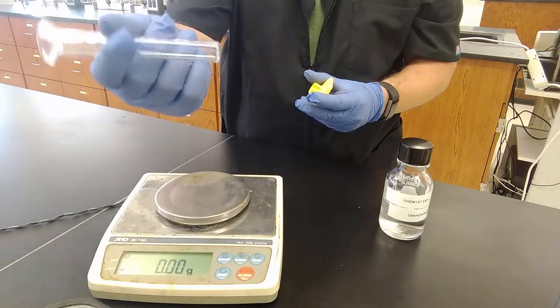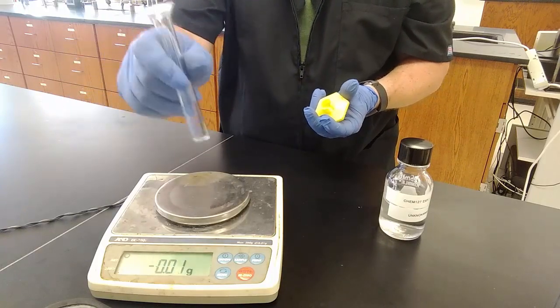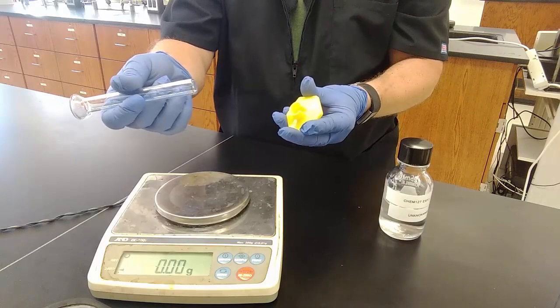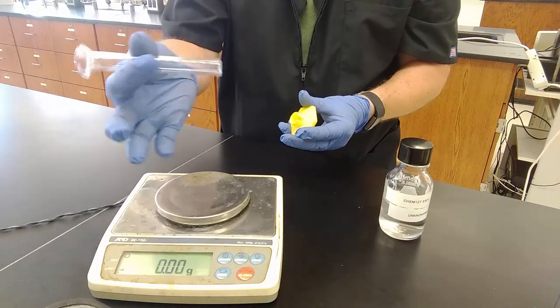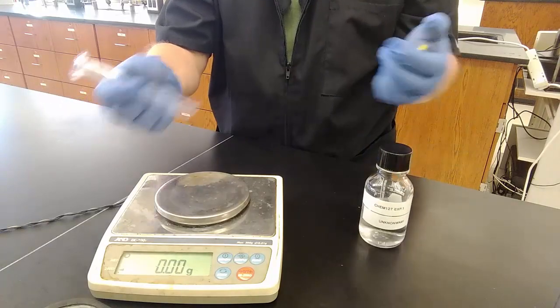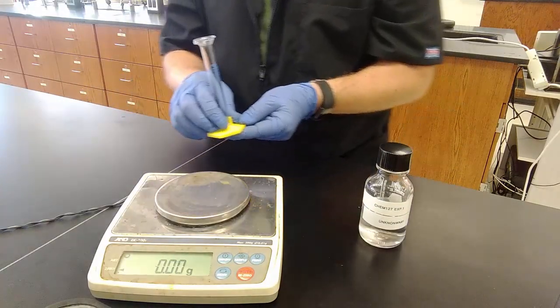You know, if I had washed it ahead of time, it might have droplets of liquid in it, and I would need to dry those out really well. But I didn't wash it ahead of time because I can see that there's nothing in it, and it doesn't matter if my unknown gets contaminated, because I just need the mass of it as it is now, and then after I put some liquid in it.